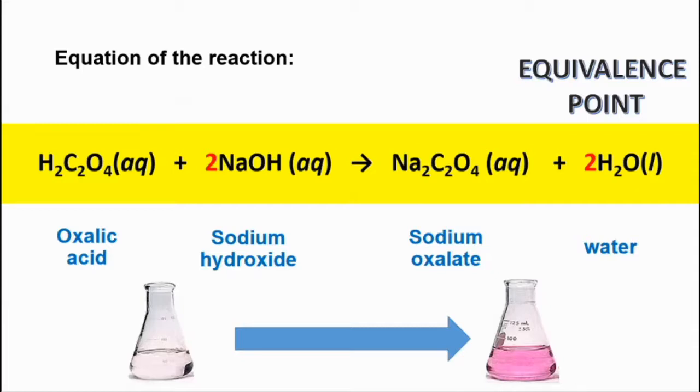Okay, pale. Try to get as pale pink as you can get. That is the best. For those who have already managed to get this pale pink, good job, guys. Right, so this is the endpoint.